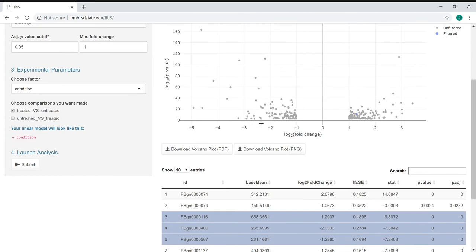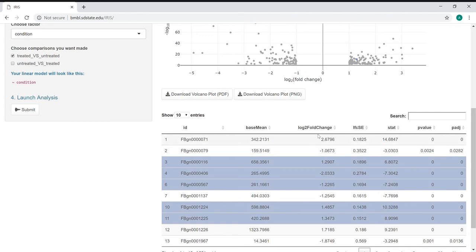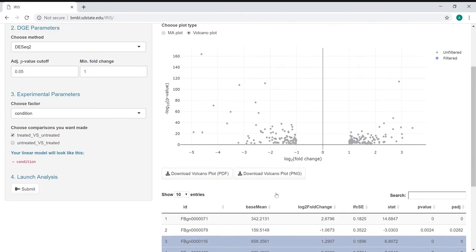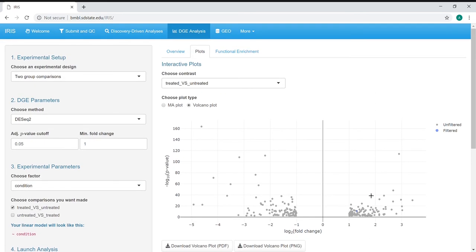Actually, when I switched between the two plots, this did not get changed. So what I see is this same one is highlighted. These are also all highlighted within this figure. Again, downloadable as a PDF and PNG plot.